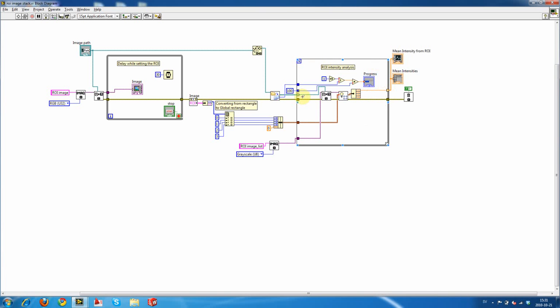So here, where it separates them into individual components, on the output, we're actually putting them into an indexed array, so we're stacking them up one on top of each other. So it does it itself, it's just an indexing function as part of these loops, so that when we display this, they have their own numbers associated with them.